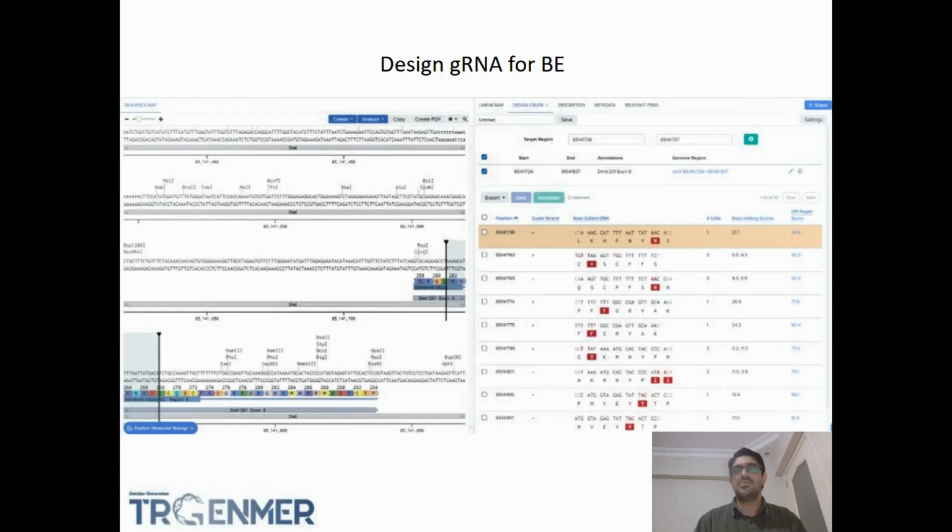On the right side, you can see the red boxes, which are the new amino acids after the base editor system changes the nucleotide, with either the cytosine deaminase or the adenosine deaminase. This is up to you, depending on which variant or mutation you want to change in a genome.